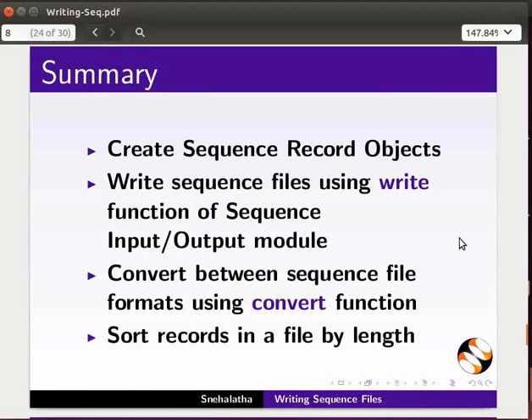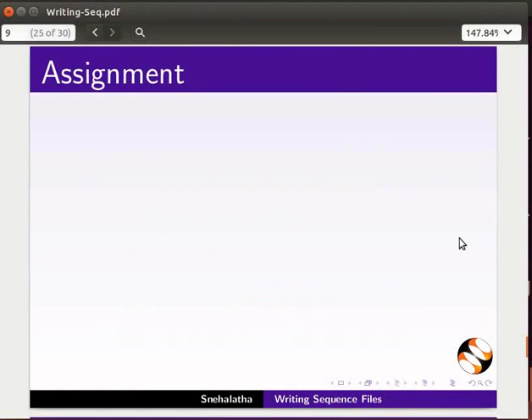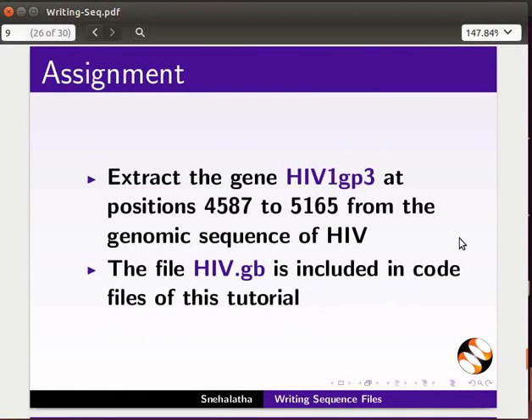Let's summarize. In this tutorial, we have learned to create sequence record objects, write sequence files using the write function of the SeqIO module, convert between sequence file formats using the convert function, and sort records in a file by length. For the assignment, extract the gene HIV1 GP3 at positions 4587 to 5165 from the genomic sequence of HIV. The file HIV.GB is included in the code files of this tutorial.